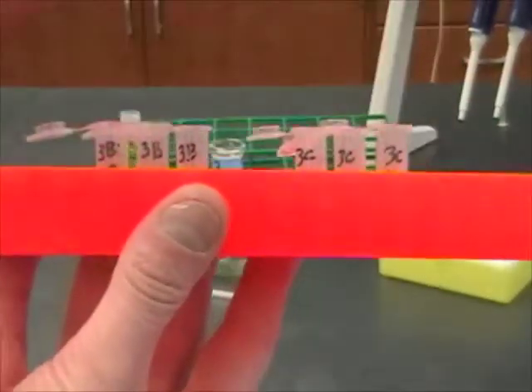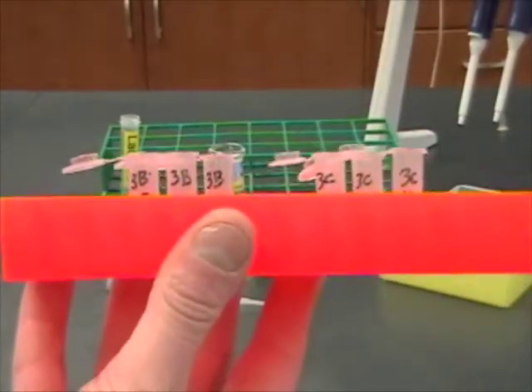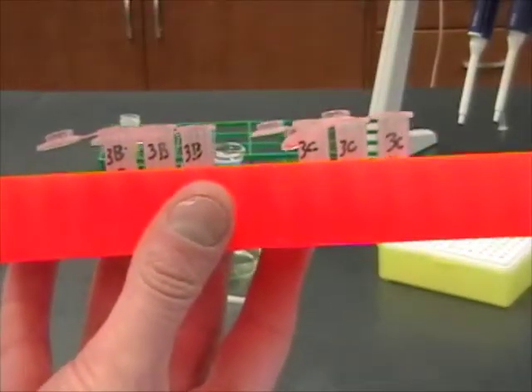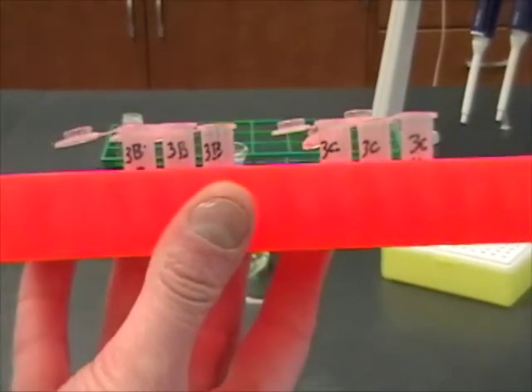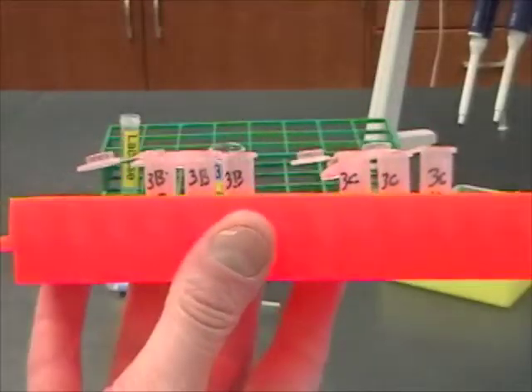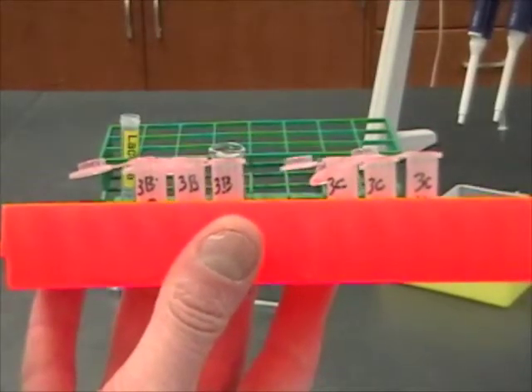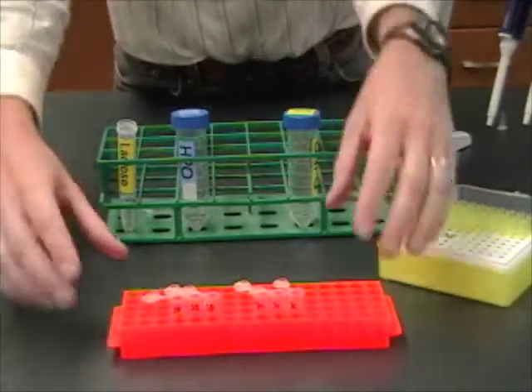Now, there's just six tubes here, but these are only the tubes that I need. Everybody in the lab is going to need the six tubes labeled 1B, 2B, et cetera. So, there's going to be a lot of tubes in here. You've got to get them all measured out before you start.